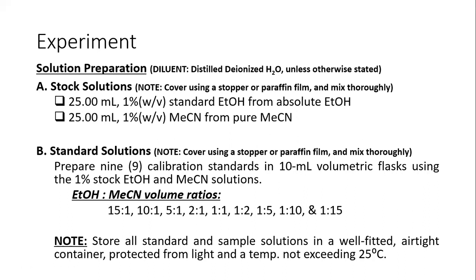It is important that you store these solutions in a well-fitted and airtight container, and that it should be protected from light and high temperature. Take note that we want to analyze ethanol in your sample, so your calibration standards which contain ethanol should also be well-contained in the container for your solution for analysis.